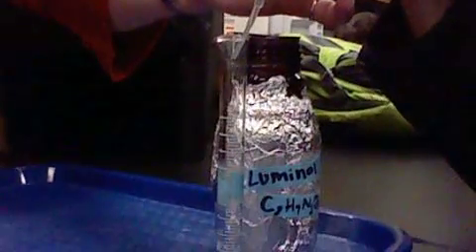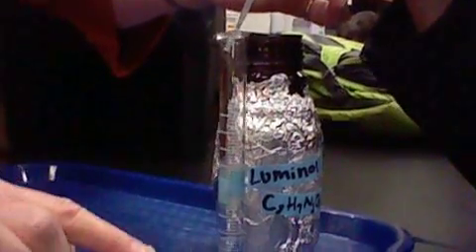So let's squeeze, dip, and then release. Okay, let's try that again. Squeeze it really tight, then dip, now release. All right, now release it in there, and you can squeeze it. Now, tell me, do we need more or not? More. Okay, so let's try again.